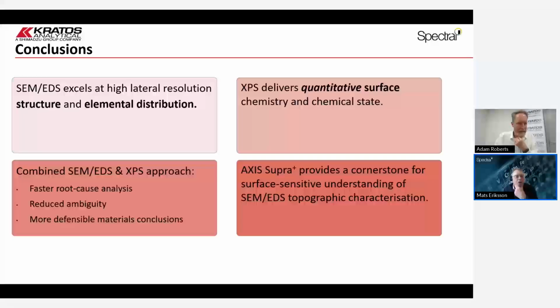I commented also about the complementary technique of glow discharge, as I mentioned before. And of course, it is always hard in these overviews, when you look at the different techniques, to cover all the aspects. Absolutely, I acknowledge that can be a useful technique. Oh, sorry, Matt, talking over you.